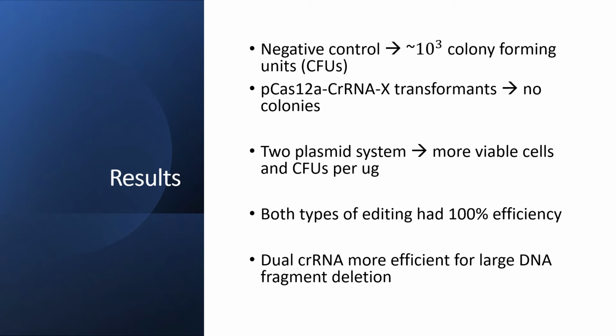For the third section, they wanted to test the capacity of the CRISPR-Cas12a system to do gene insertion and replacement using the RFP and LacZ genes. So they found that editing efficiencies were 75%, so that was 9 out of 12, and 67%, which was 8 out of 12, for insertion and replacement of the RFP gene.